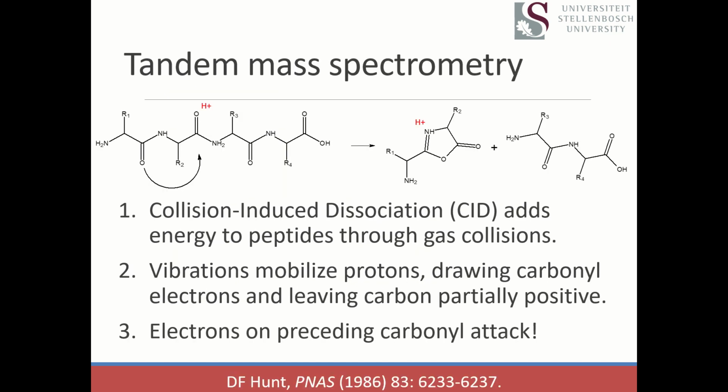I want to start with a little bit of analytical chemistry. There's a kind of broad misconception in our field that the process of CID somehow explodes peptides, that it makes them blow up, that it's so energetic it just smashes apart a peptide bond to create fragment ions. And this is a misconception that I think makes people ignore the chemistry of what's going on. So let's start with defining CID.